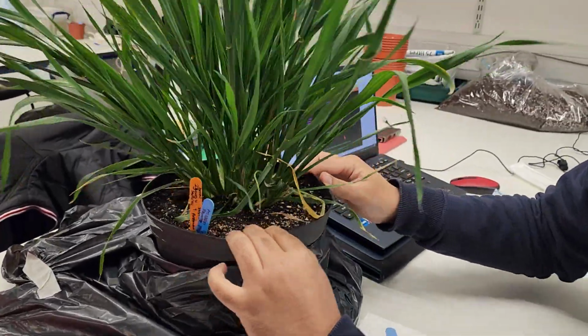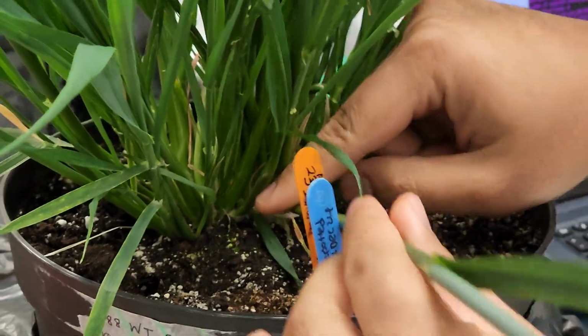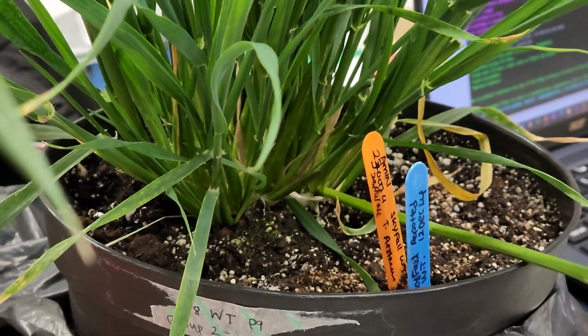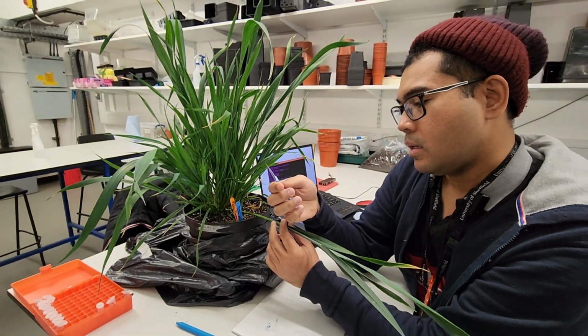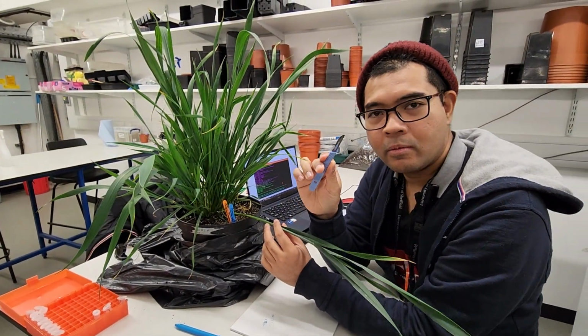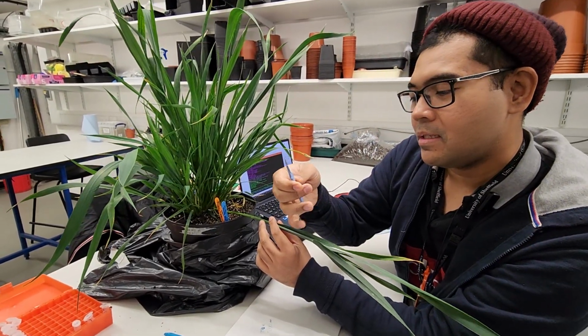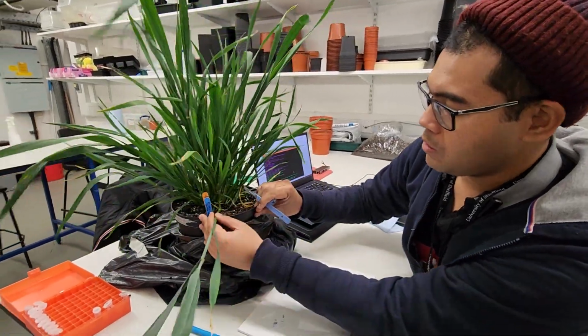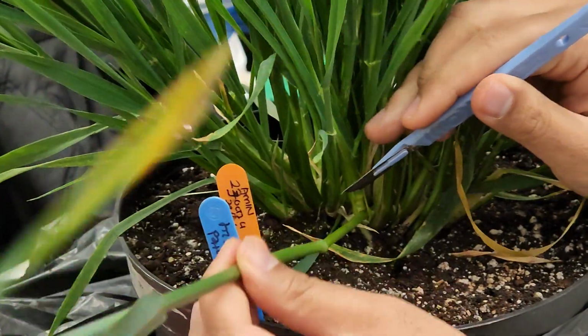Is it tiller or culm? Okay, that looks like a good candidate. So we use this scalpel, a disposable scalpel. It's blunt. Actually, this one is more than 10 years old, so it's blunt. Size 10. We go all the way down. We don't want it to be uncertain. I think this is a bit uncertain.